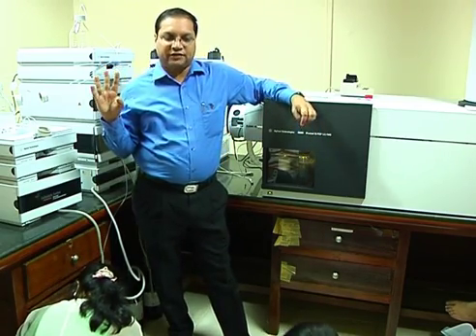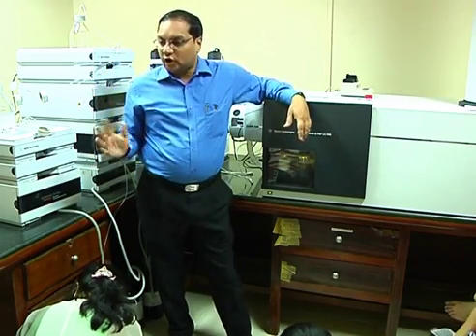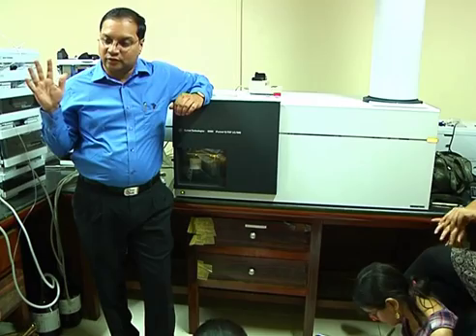Okay, modes of acquisition, if I say so, in terms of application. First is TOF only mode, TOF only. So as an applicability, we can run in 3 different modes. First is the TOF only or MS only mode.